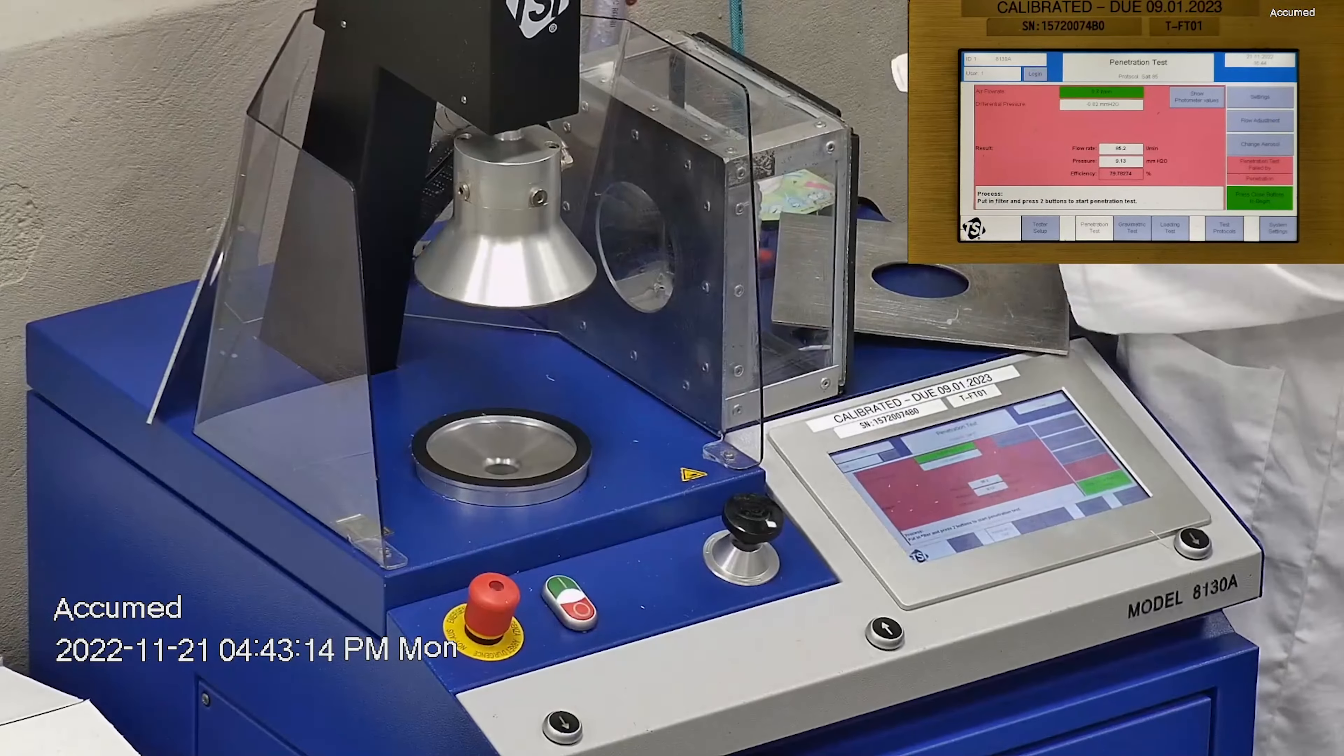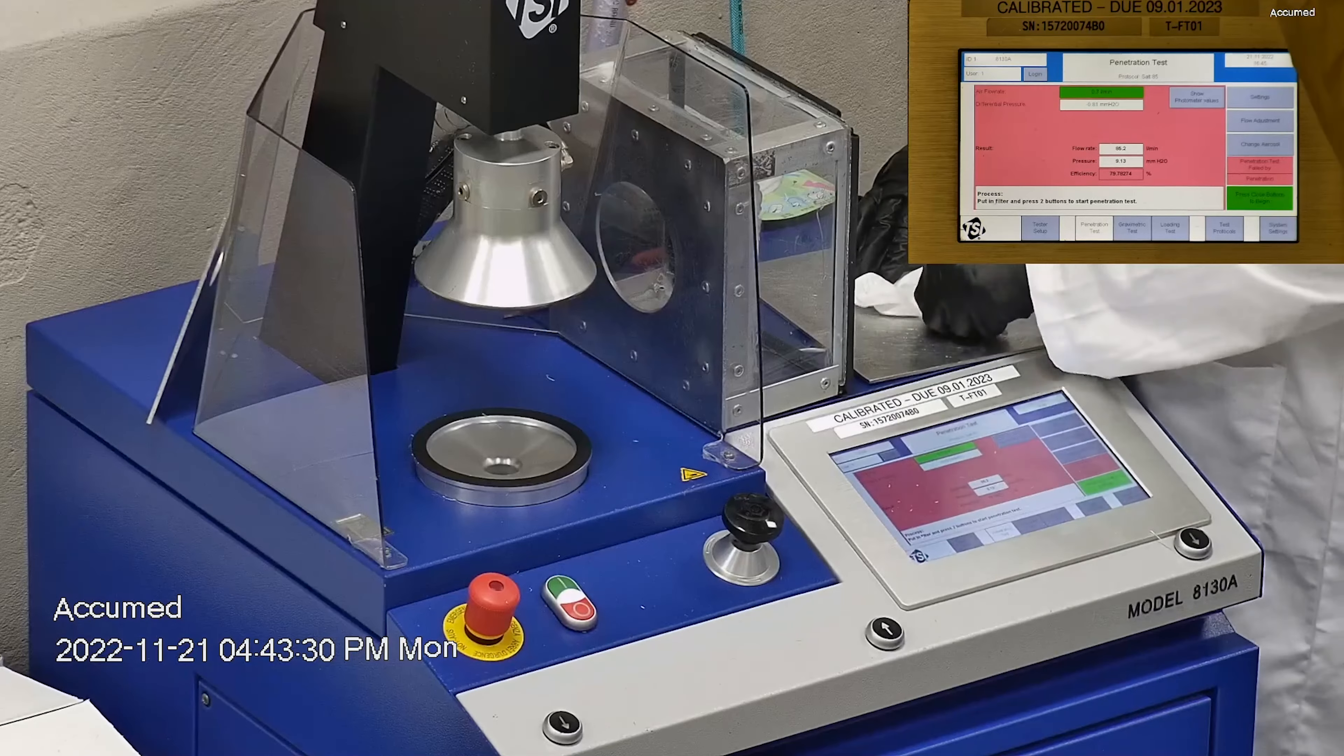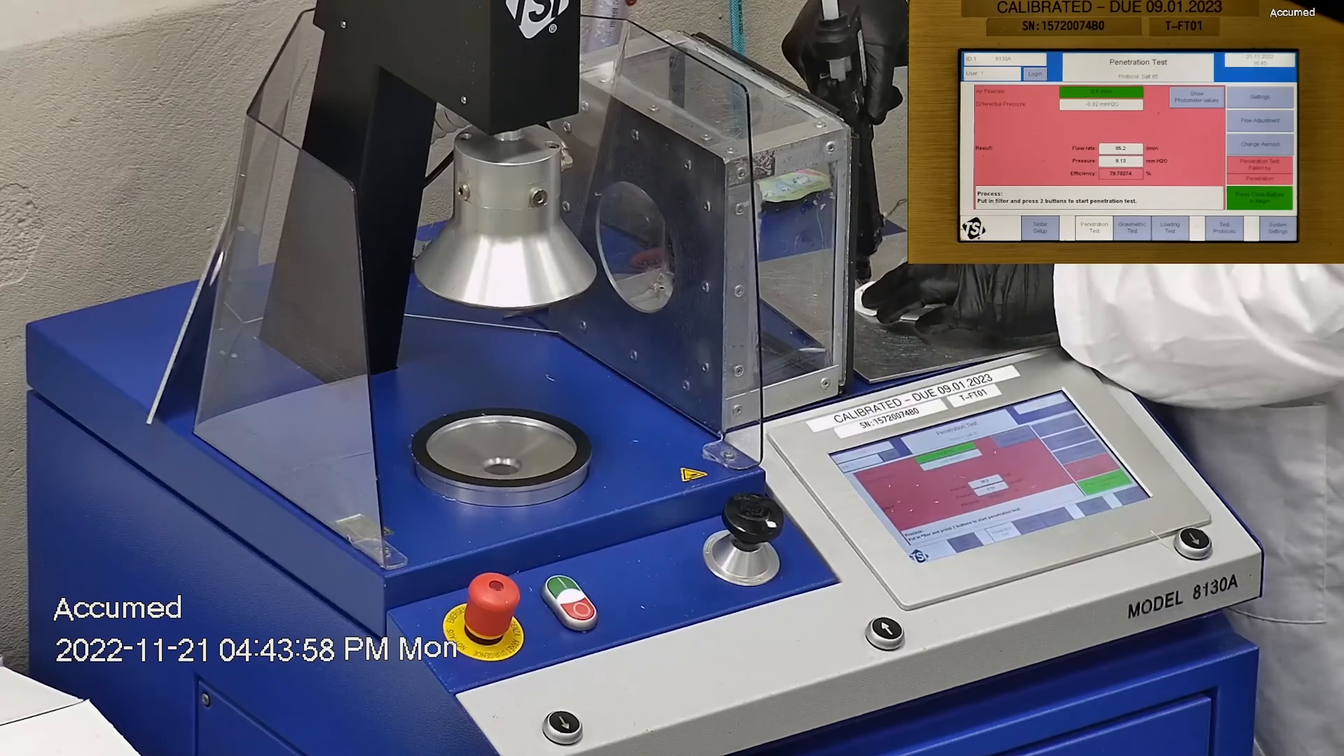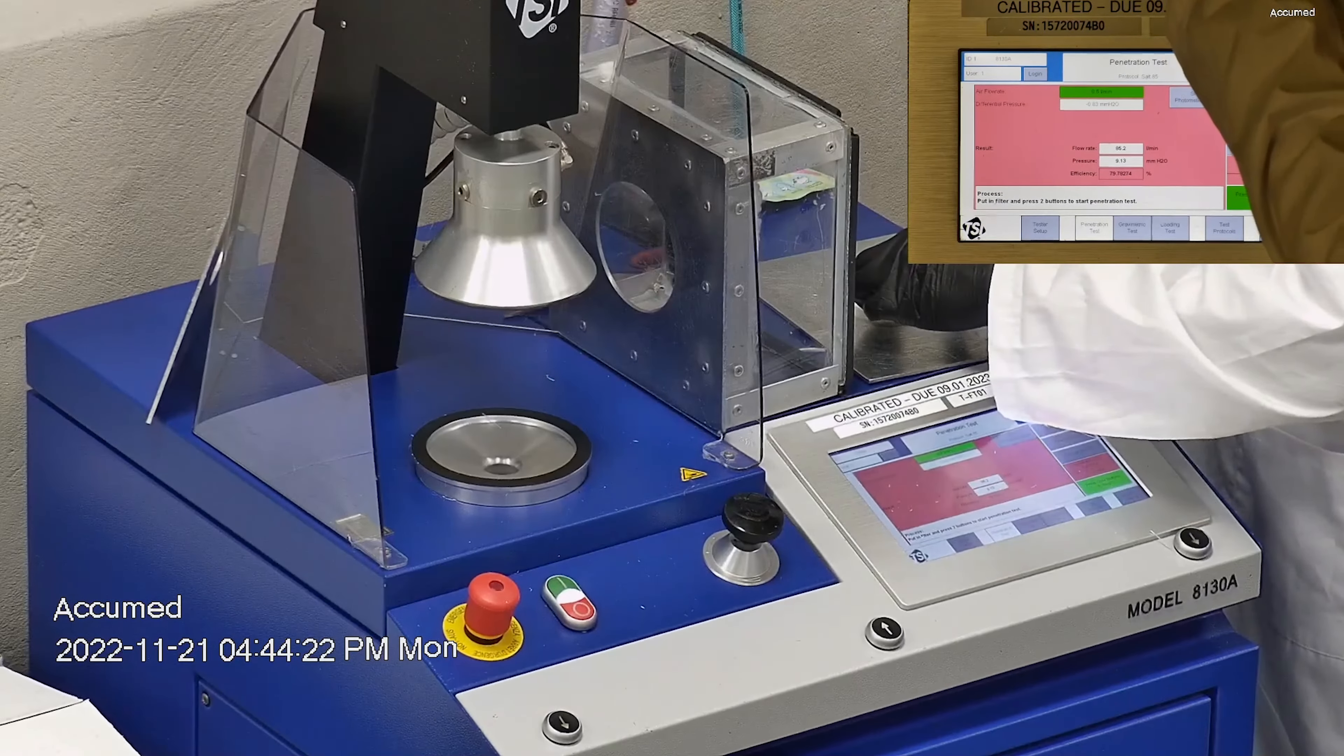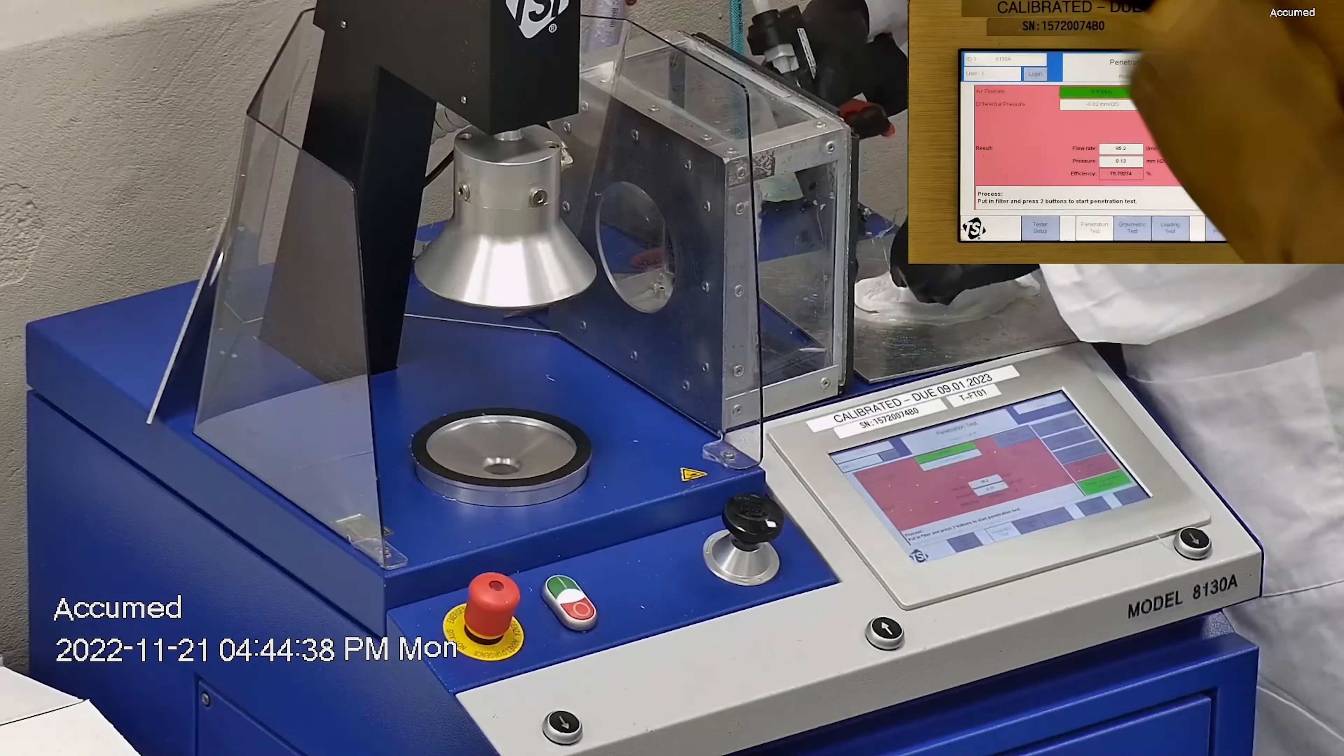The results are displayed on the TSI monitor. F stands for air flow rate, which we test at 85 liters per minute. R is for resistance, also referred to as pressure drop. This correlates with breathability, so the lower the number, the more comfortable and breathable the mask is. E stands for filtration efficiency percentage.